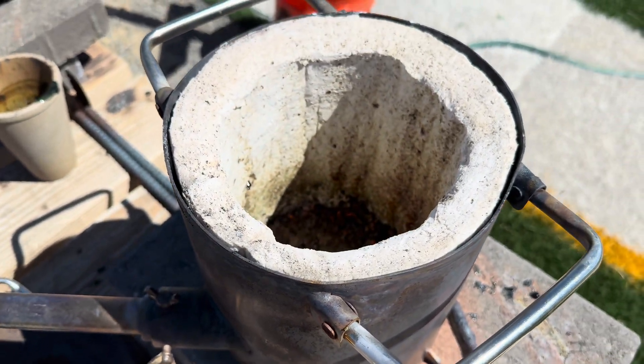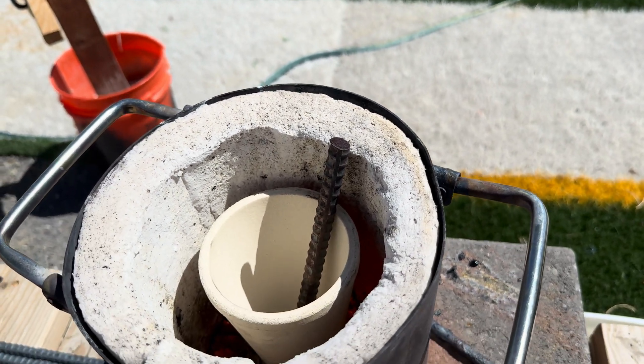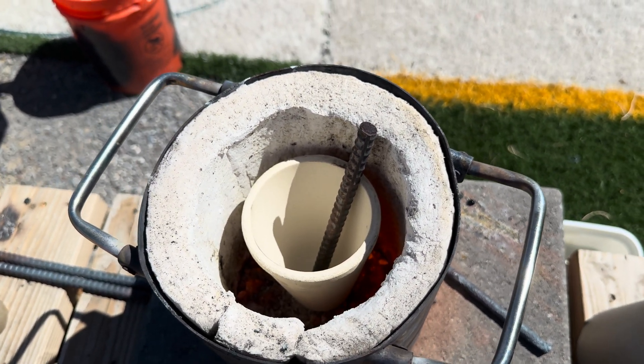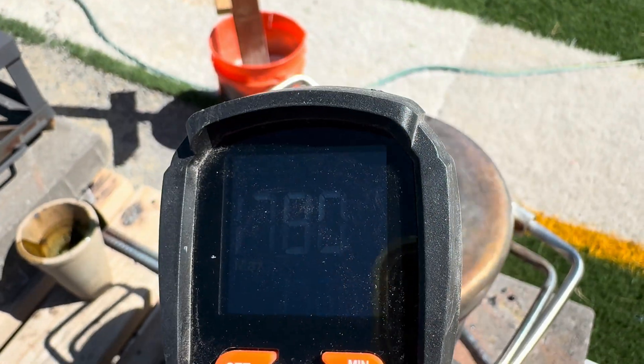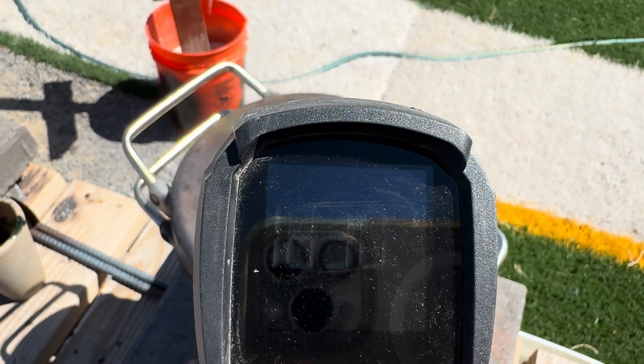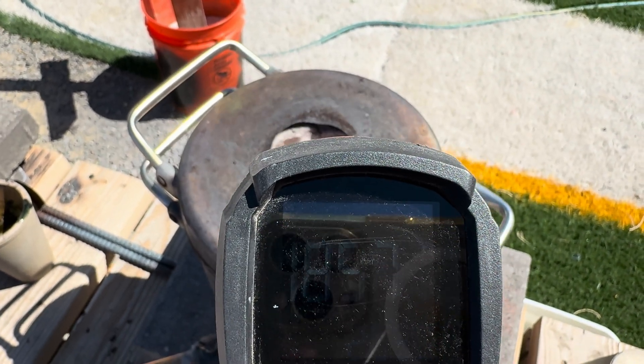We are now heating up our furnace. We have now added in our crucible and our stick of rebar as a collector metal. Our furnace and crucible is up to 1,500 degrees. Now it's time to add in our flux with high litharge with flour.